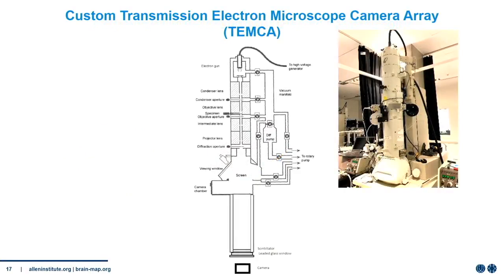And then, to give you a cartoon schematic before we hand off this part of the talk to talk about the actual imaging itself in terms of the pipeline and process, I wanted to show you exactly how we put these things together. So first, we install the reel-to-reel system, and then second, we add a column extension here, which increases our effective field of view without having to go to a high magnification. So basically, it's like an image projector.